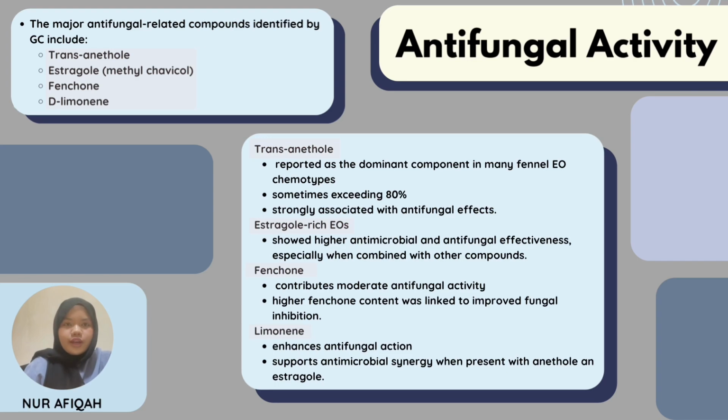Next, we move to antifungal activity. Gas chromatography analysis revealed that fennel essential oil contains several bioactive compounds responsible for antifungal activity. The major compounds identified by GC include trans-anethole, estragole, fenchone, and D-limonene. Among these, trans-anethole was reported as the dominant compound in many fennel essential oil chemotypes. Estragole-rich essential oils show stronger antifungal effectiveness, especially when combined with other components.